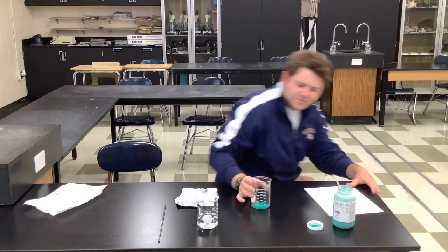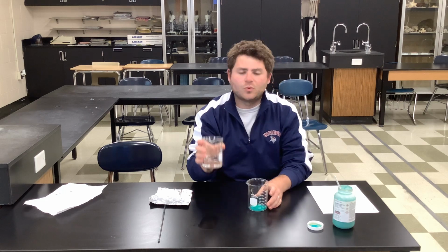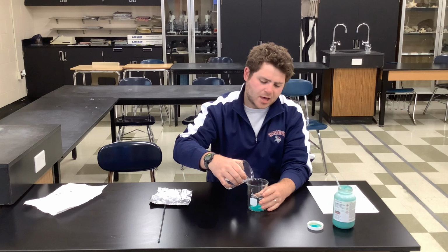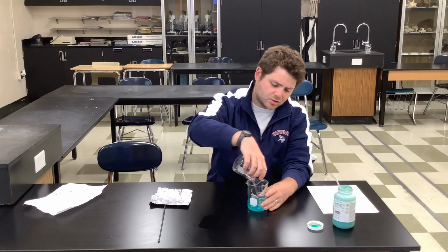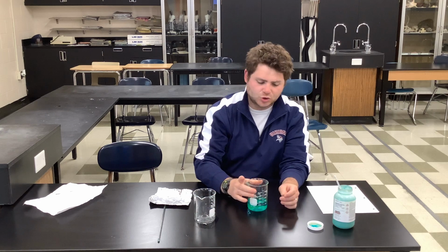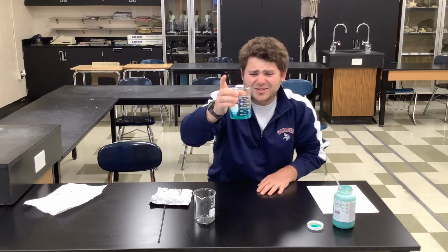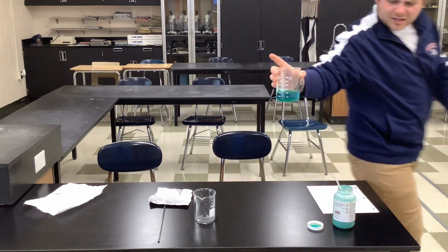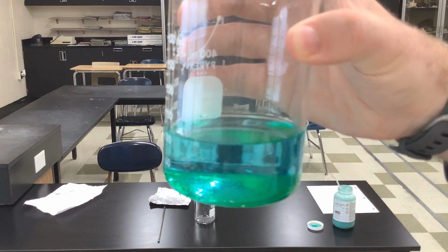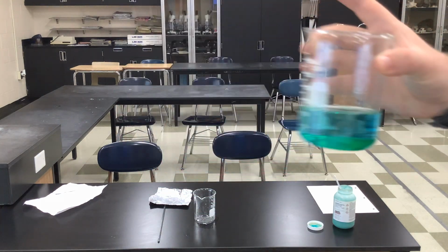So once you've observed what it looks like, I want you guys to add the water. So this is 100 milliliters of water. You will add it to your solution, okay? And then I want you to observe how it looks now, all right? So the water changed slightly, all right? It looks a little greenish, but we can still see it sitting there at the bottom.